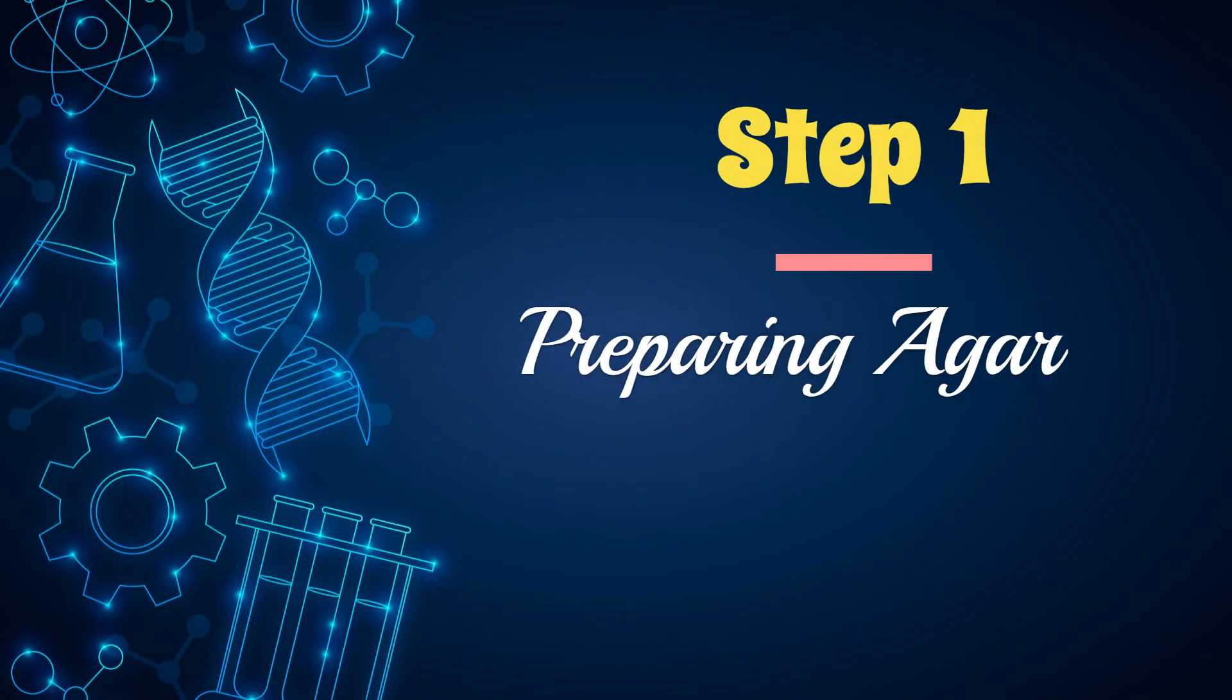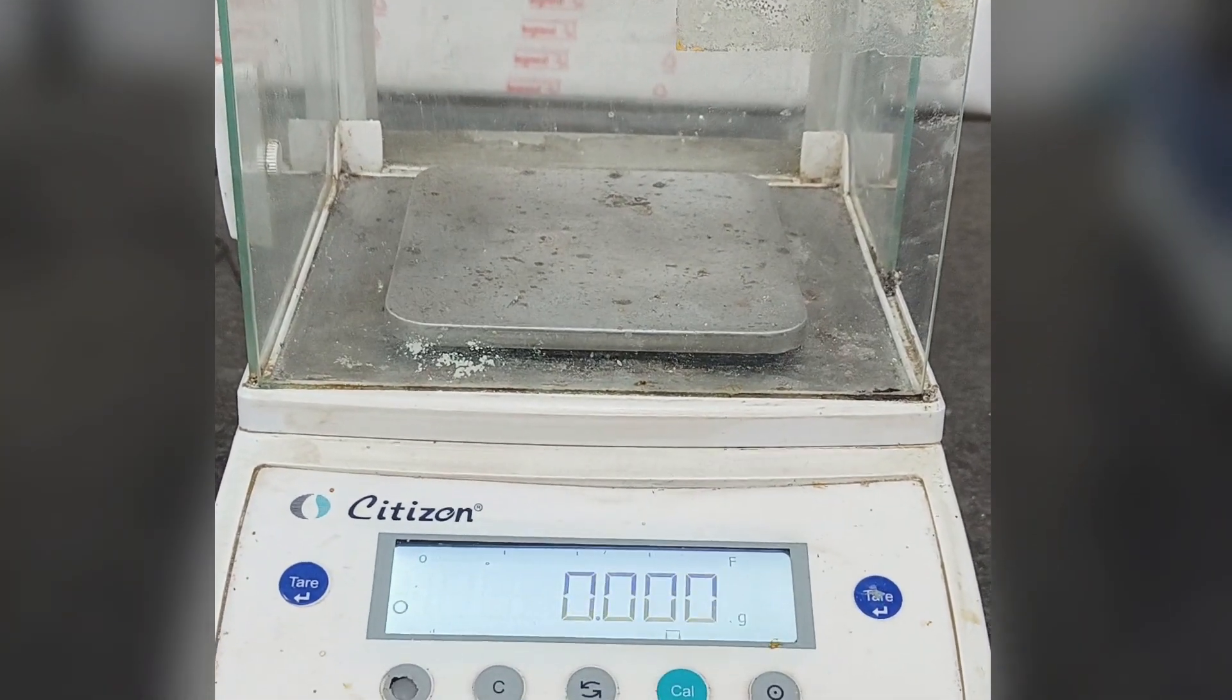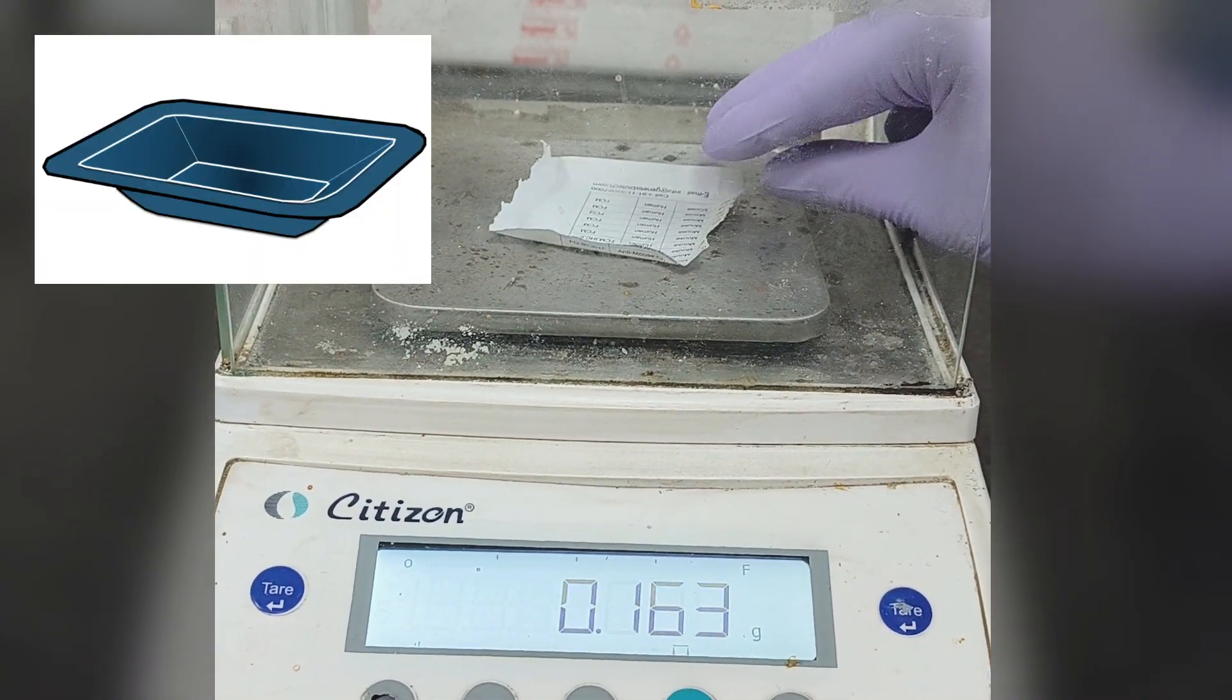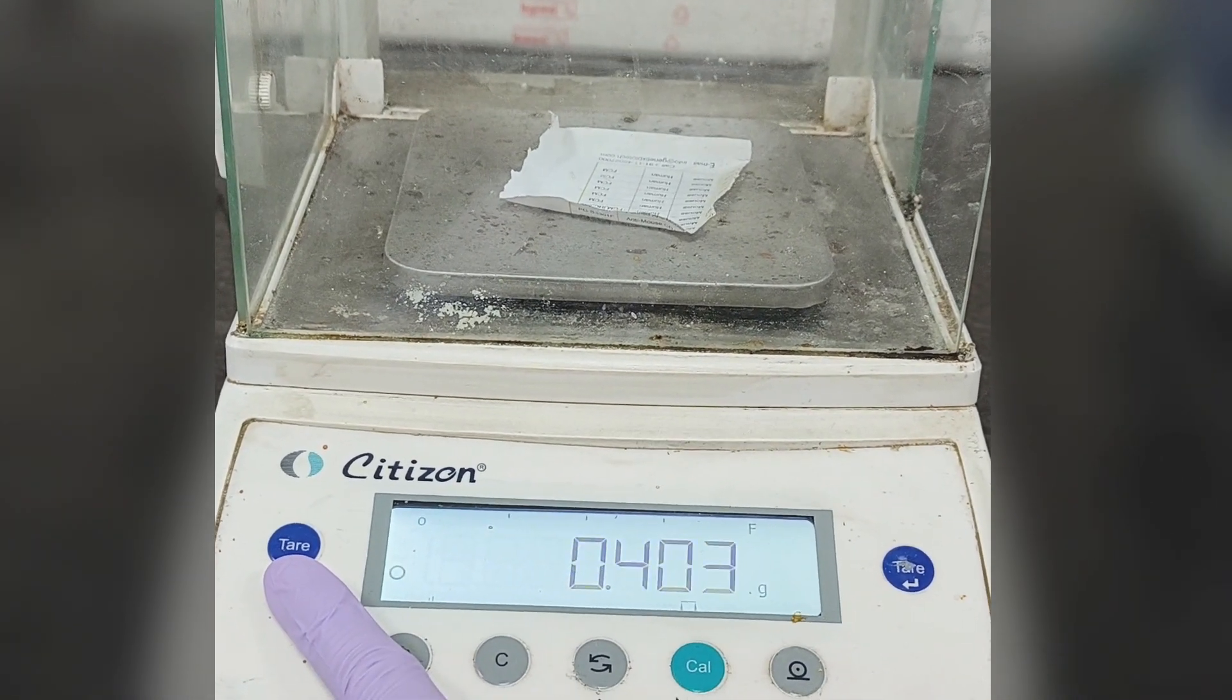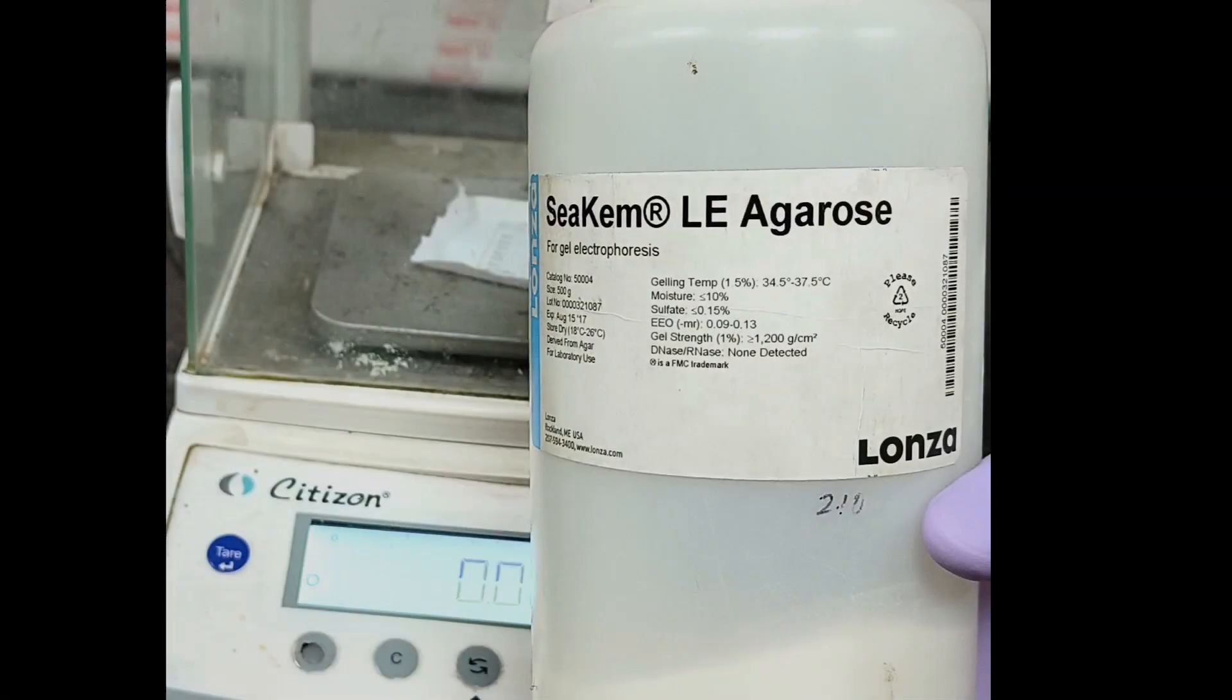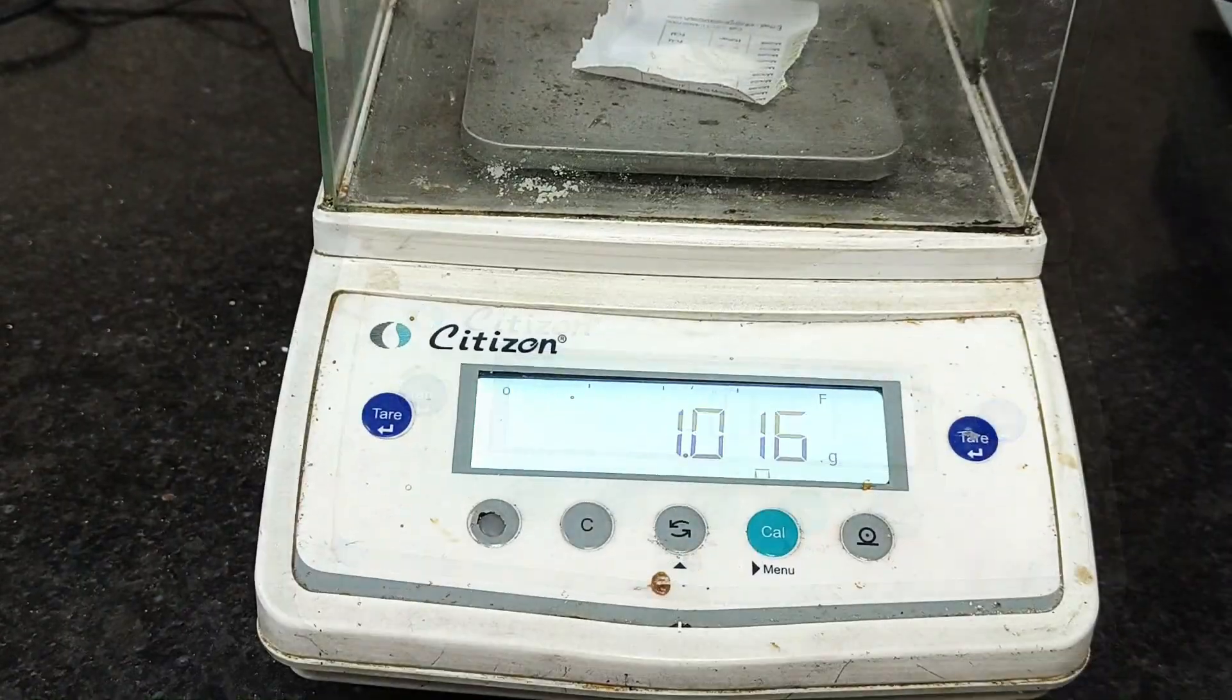Let's begin with the agarose gel preparation. We will make 1% agarose gel. For this, place a paper or weighing board on the weighing balance, and press tare or zero button to nullify the weight of the paper to weigh the agarose accurately. Weigh about 1 gram of agarose powder.